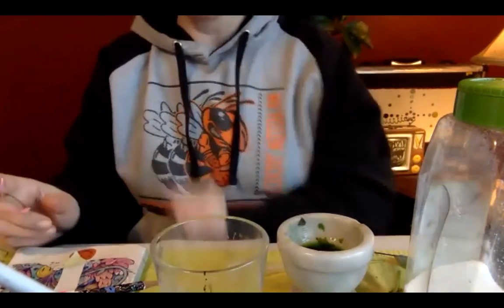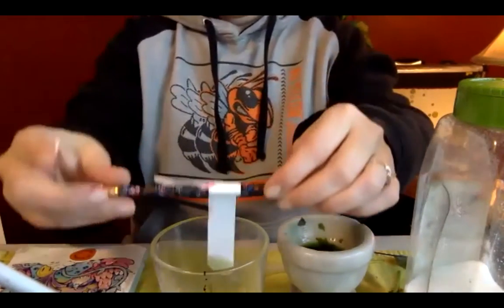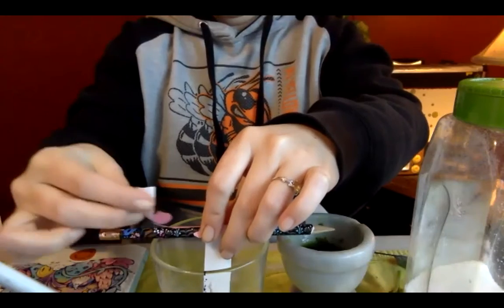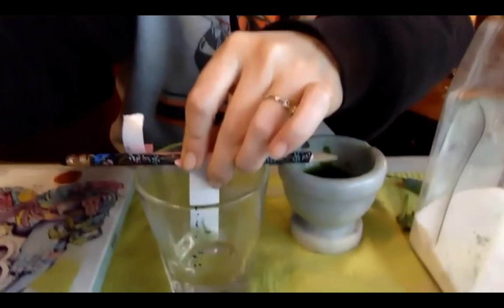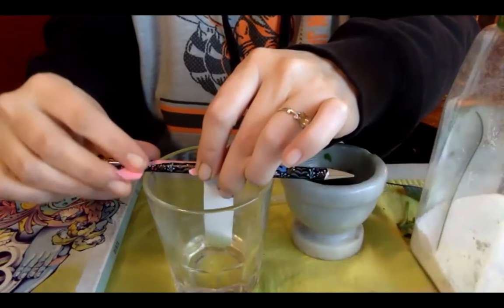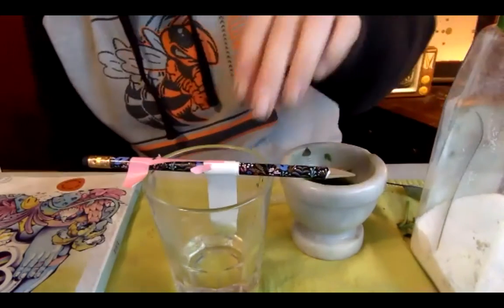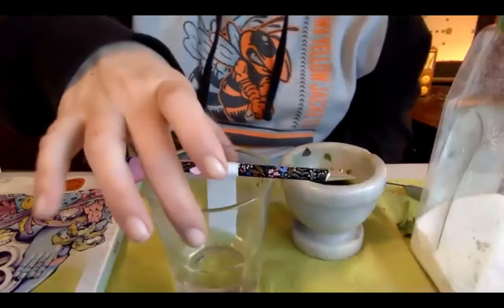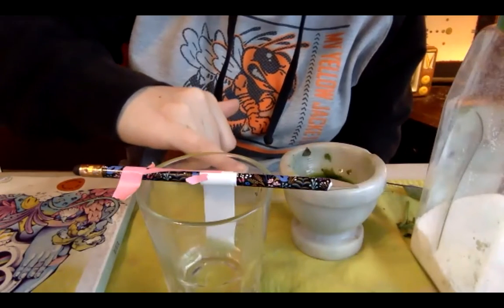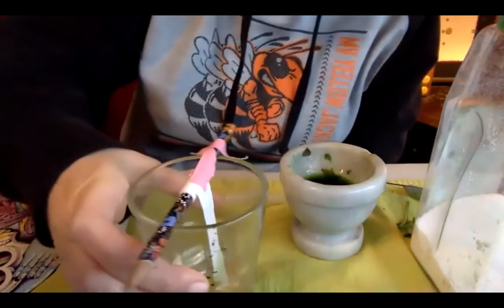This can take up to 30 minutes to let the solution carry the pigments all the way through, so I don't want to have to sit here and hold it. So I've just got the tip of the chromatography paper in there. Just crudely stopping the pencil. Sometimes it gets annoying. You don't want it to touch the sides. And this is pretty pale, but at this point you can watch the solution carry the pigment up. We call it the dye front. You can watch the dye front move up the chromatography paper.